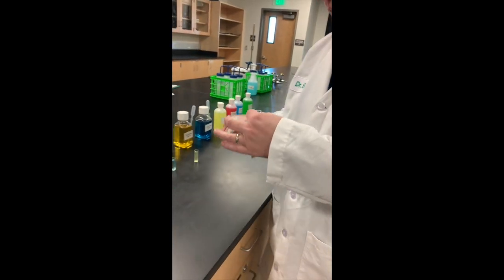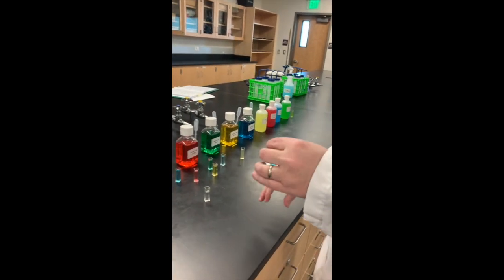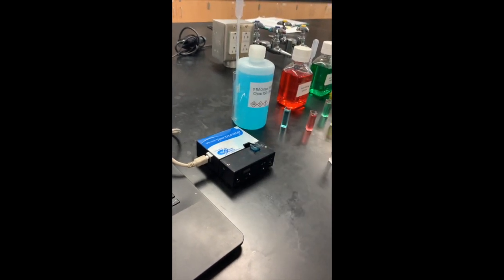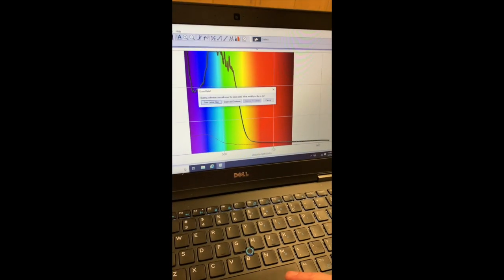There are different types of food dyes. If you ever read Red Dye 40, things of that nature. So it could just be a different variety. Now we're going to our sports drink C, and we'll see what that one looks like.